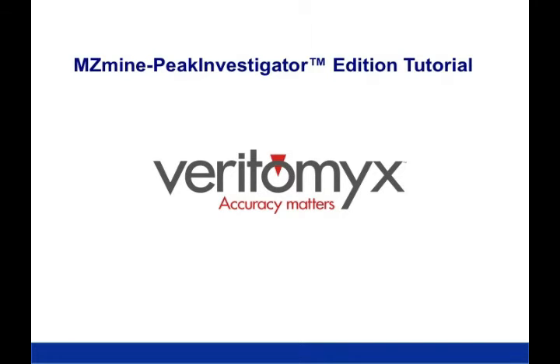MZmine is a popular Java-based open-source mass spec workflow software that will run on Windows, Mac, or Linux with a valid Java virtual machine and the open-source R statistical package installed.